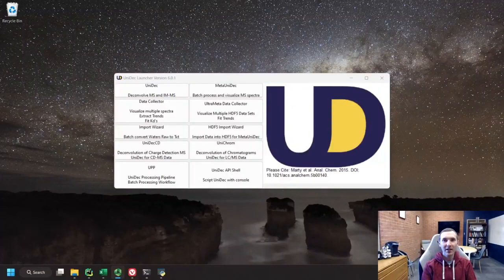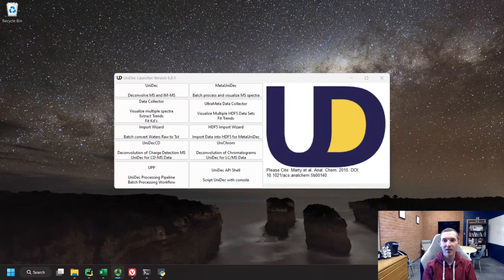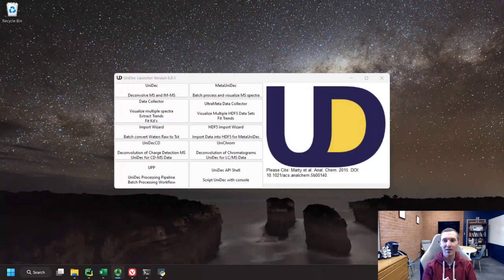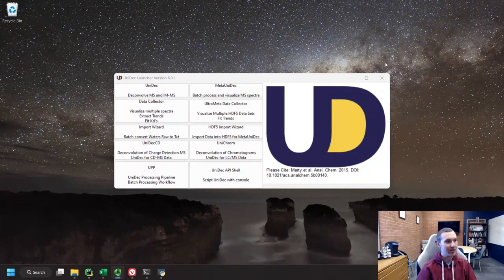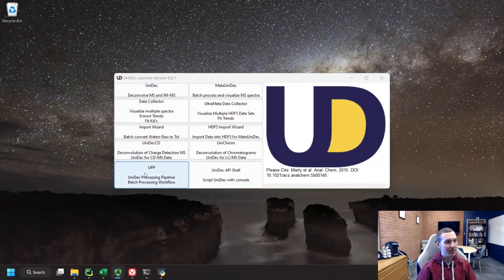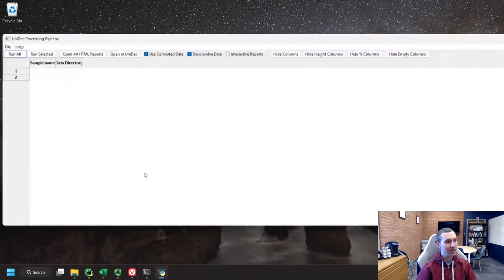Hello and welcome to another UniDec tutorial video. I'm Michael Marty from the University of Arizona and I'm excited today to tell you about the newest module that we've released in UniDec, which we're calling UP, or the UniDec Processing Pipeline. If you open up UniDec, you can see this is version 6.1, which will hit the web soon. There's this new window here for UP, and if you click this, you can see we're going to open the UP window.